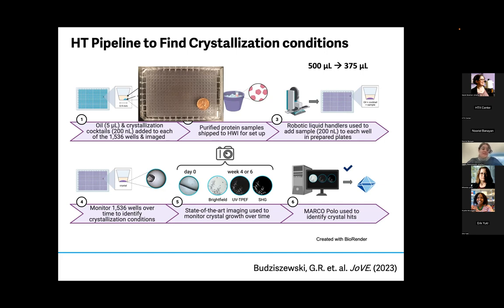This is something that we're interested in looking into in the future, whether we can harvest these crystals or do in situ diffraction experiments to get useful data from these crystals. But just note that we can send these plates back to you, but it's going to be extremely challenging if you're trying to loop them in the conventional way to be able to do so.